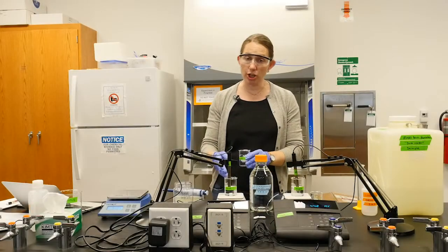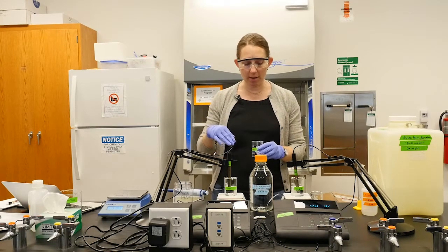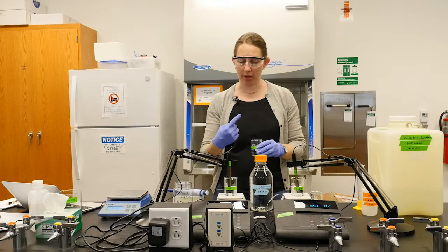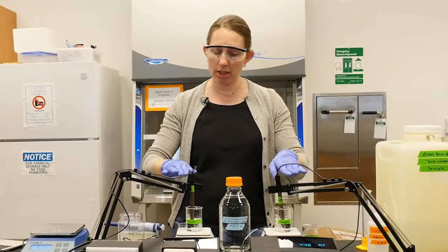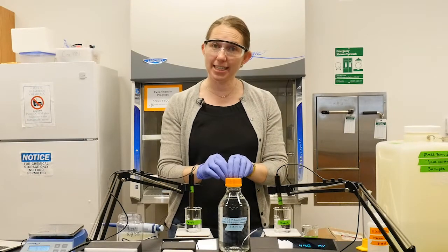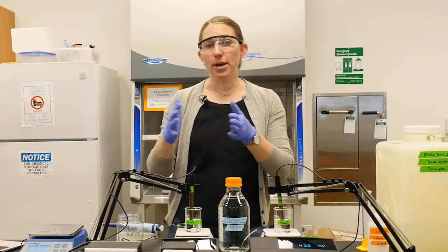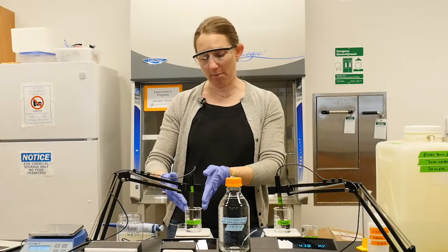We're going to use these stir plates so that each time we add acid in our titration, we're mixing that thoroughly through our sample. The way we're going to be measuring the titration is that as we add acid, we're measuring how much free proton is still in our sample here.